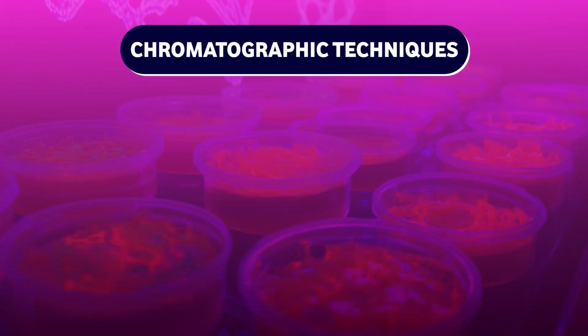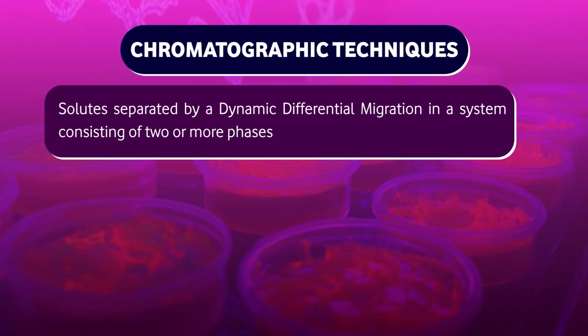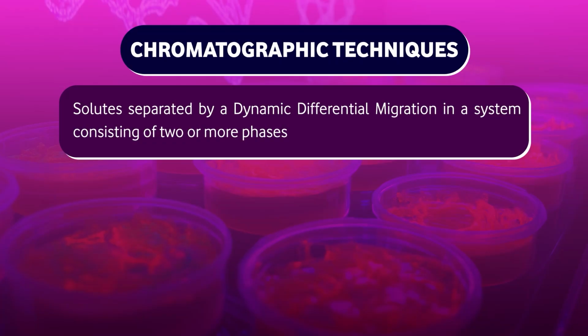Now let us talk about techniques, instrumental techniques. So we take the first technique, the chromatographic technique. To understand this technique, we must understand what chromatography is. Please understand, chromatography is nothing but the separation when the material is migrating. It is dynamic differential migration.